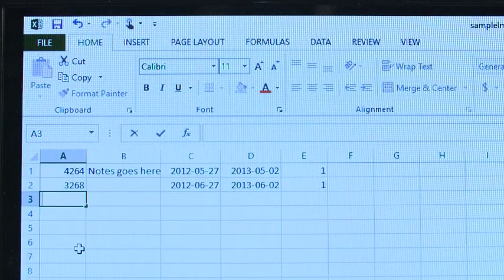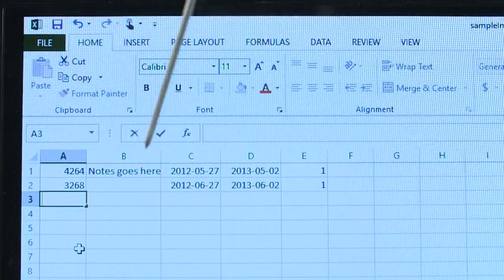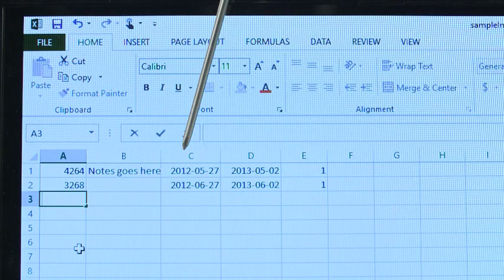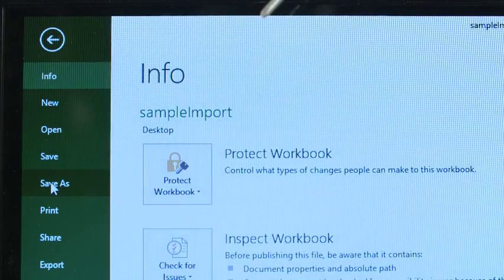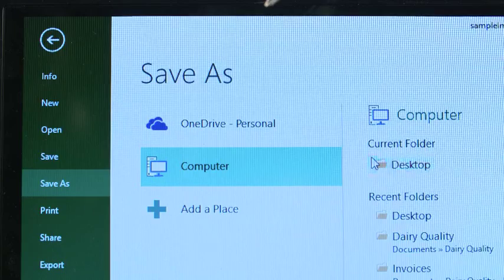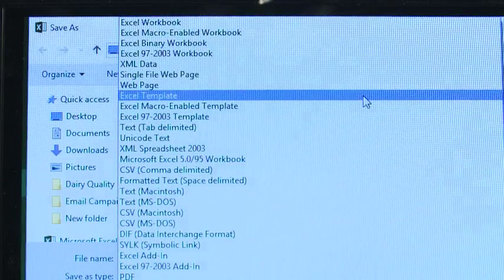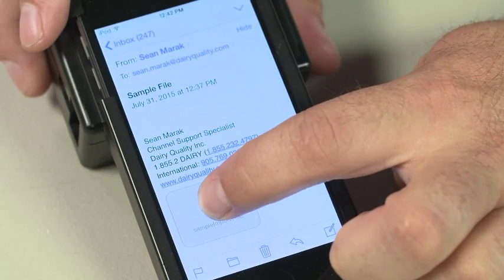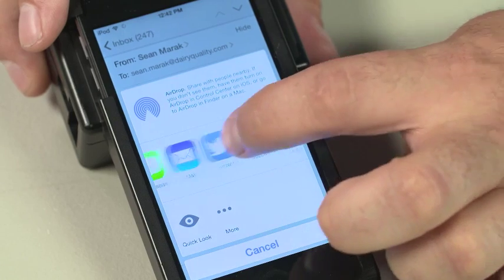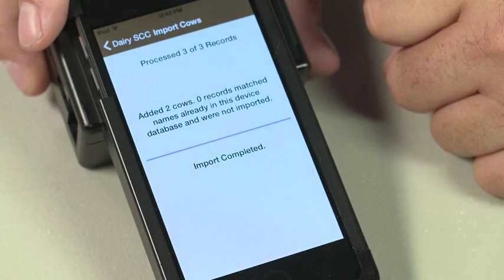To format data to be entered into the RT10 device using Microsoft Excel, create four columns on your worksheet. Column A is the cow tag number. Column B is the notes. Column C is date of birth. Column D is date of first lactation. Enter the data. To save the file, go to Save As and save the file as a text tab delimited file. Save to a folder for easy access. Email the file to the email address on the device. To retrieve the tab delimited file and merge it into the Dairy SCC app, tap Mail, open the message, then tap and hold the attachment until you see a selection of apps. Select the Dairy SCC app to open the attachment. You will see an alert screen confirming the data has been imported.